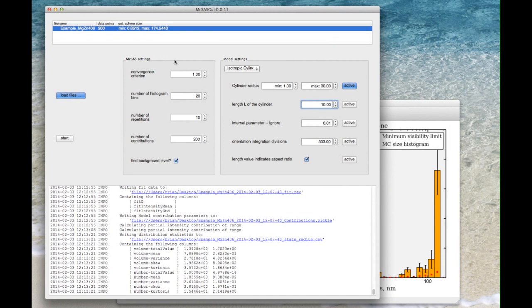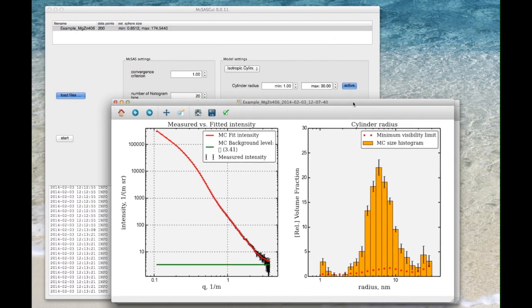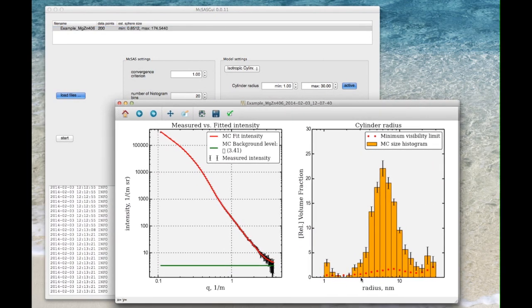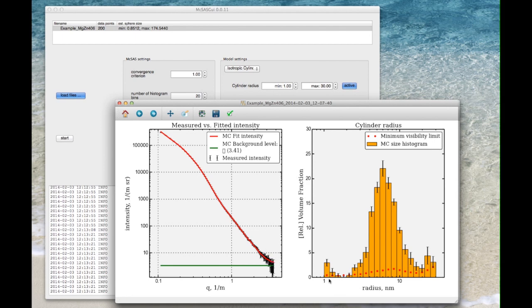So after this fit is completed you see that the result now actually fits the data equally well. Again we have reached convergence. And the radius of these cylinders now spans between 1 and 30 nanometers.